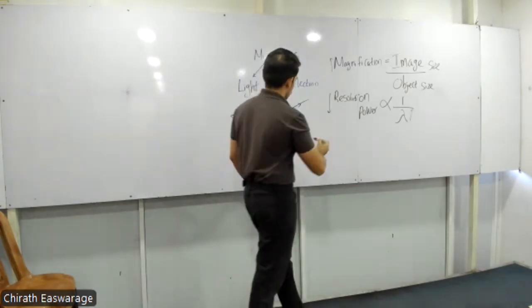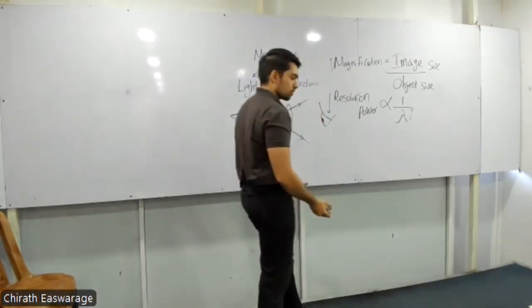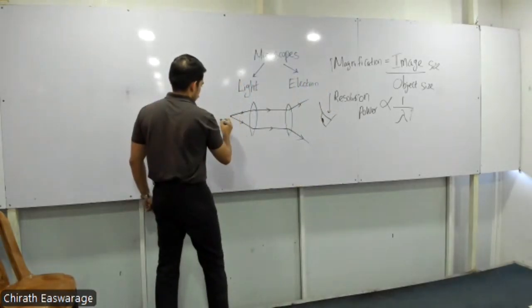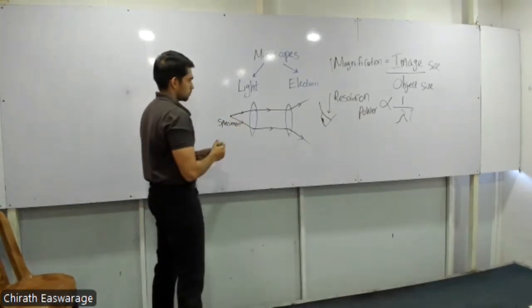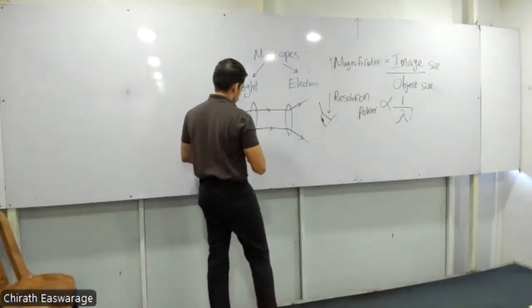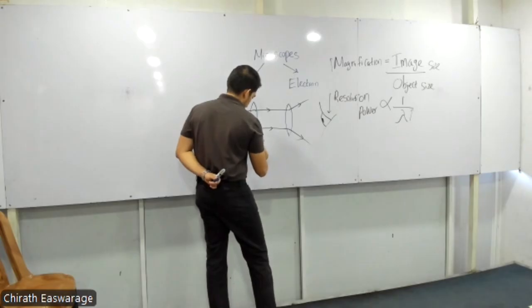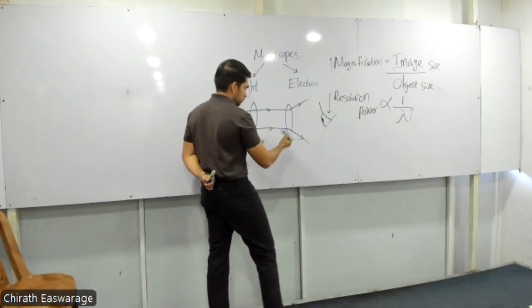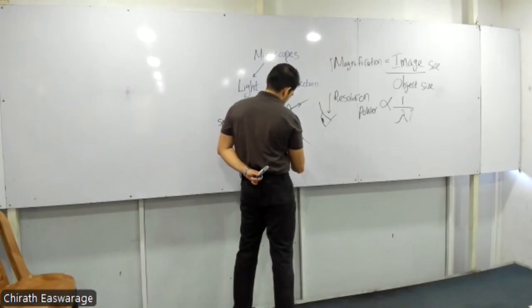Yes. So here we have our eye, right? The observer is here. This is what? A very small specimen. Draw this in the tute. This is the objective lens. Small line diagram, draw this. This is the eyepiece lens.